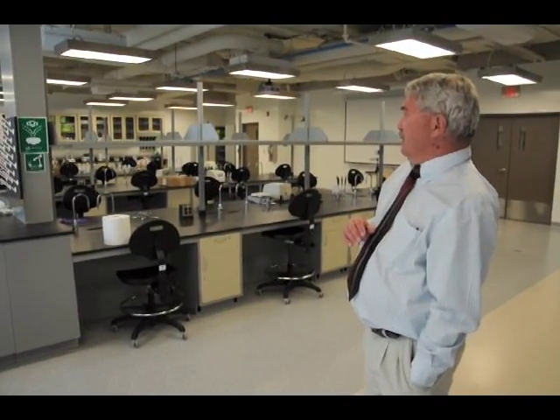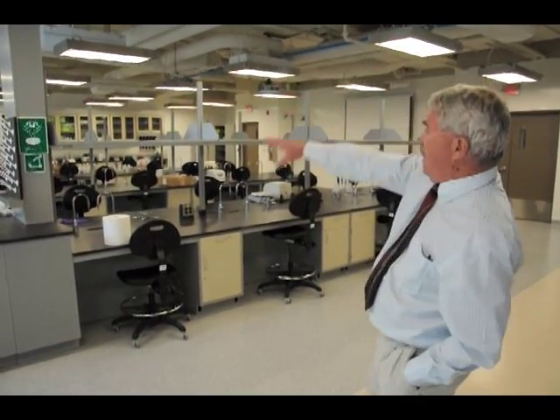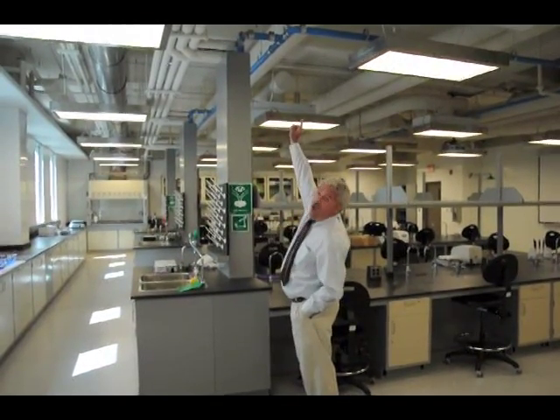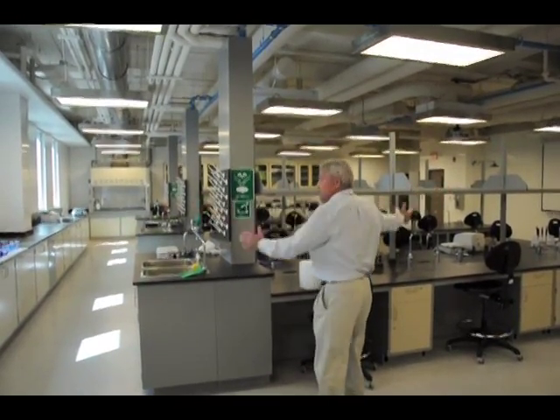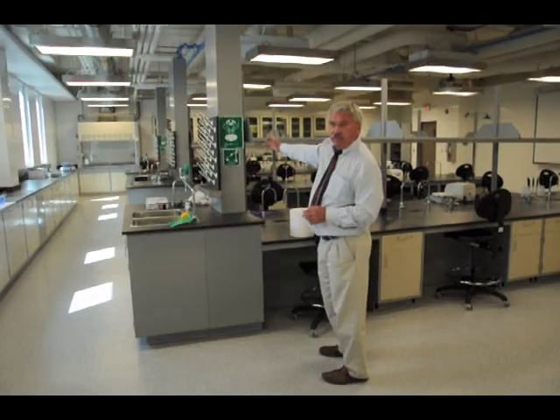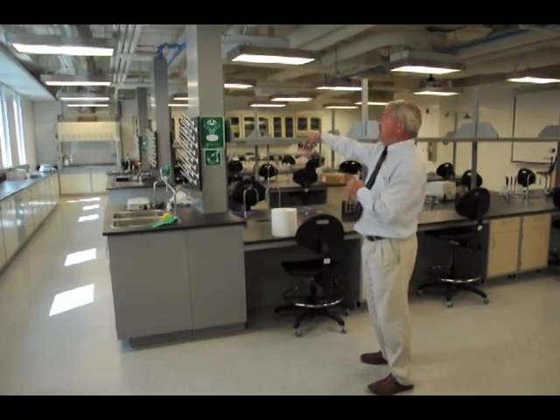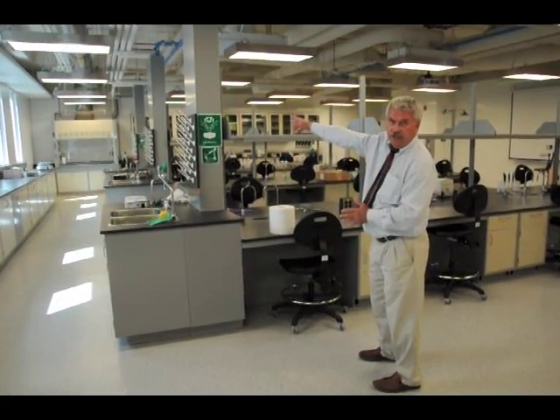One of the interesting things about this cell biology lab is its versatility and mobility. All the benches are easily moved, and if you look up this central column here, you'll see that all your utilities, water, gas, electrical, sewer, all go up or come down. So it's very easy to move this whole set of benches around, changing the layout of the benchwork in this space and just dropping the utilities down from the ceiling to reattach everything back to the workspace. So we can reconfigure when and if we need to. We can reconfigure this space merely by moving the benchwork around to suit our needs and then dropping our utilities down into this central channel here.